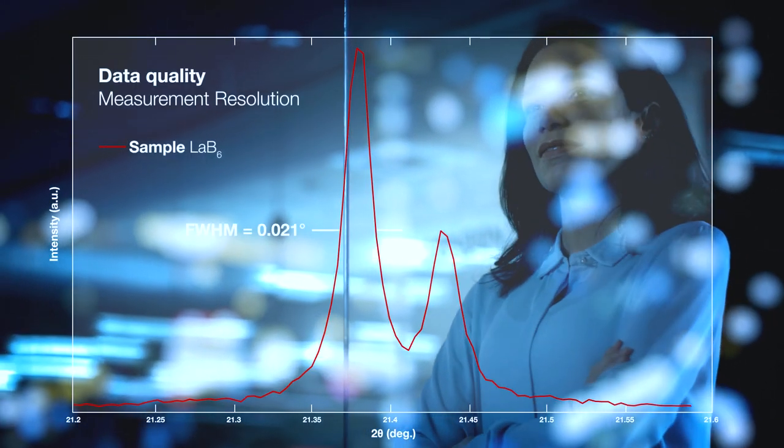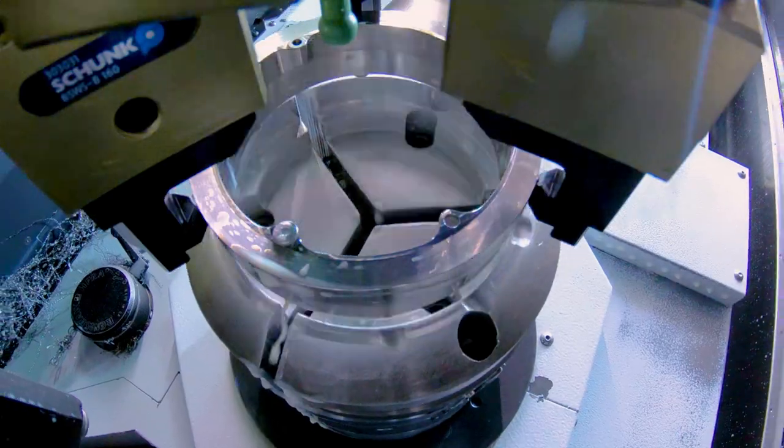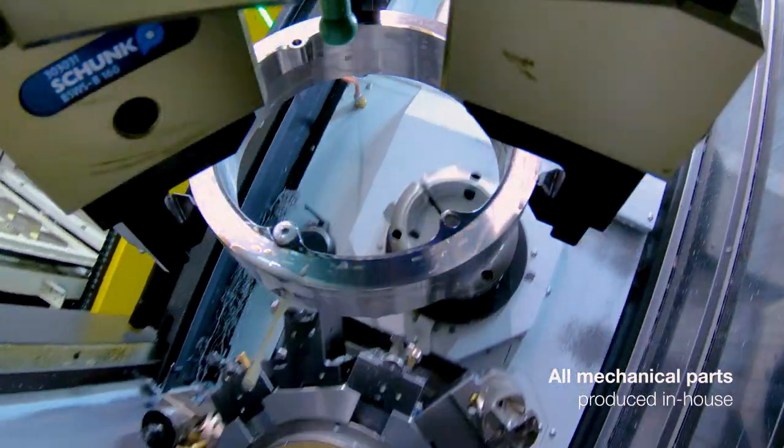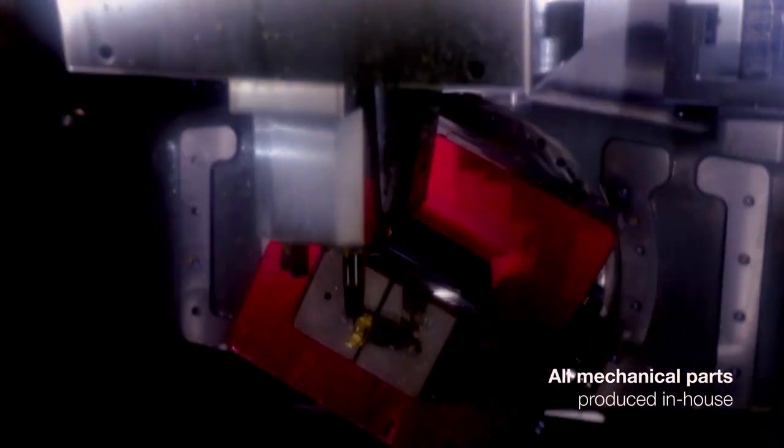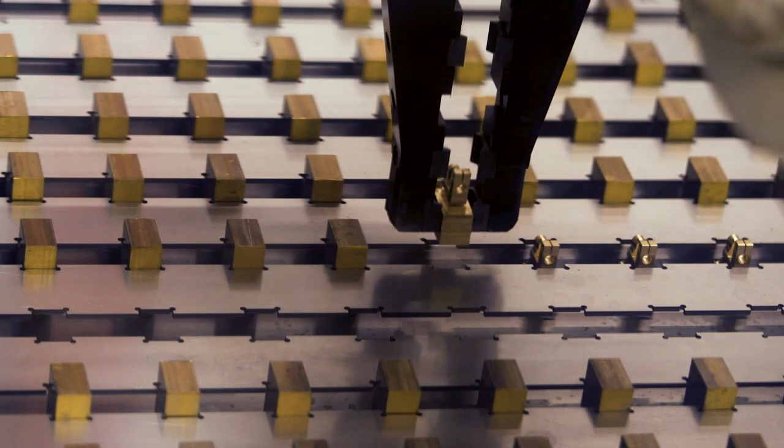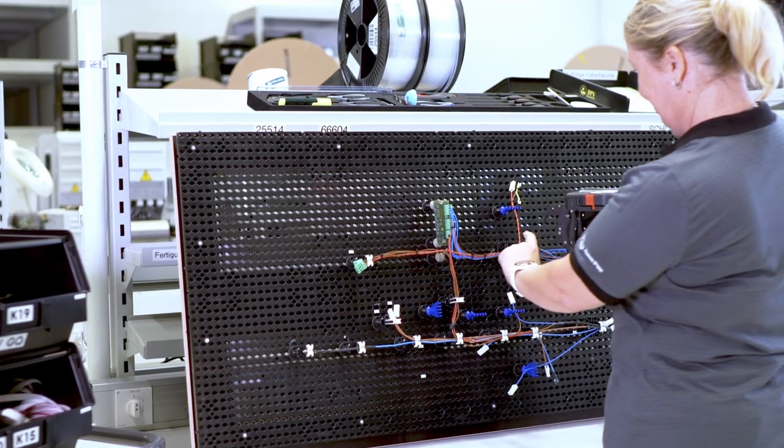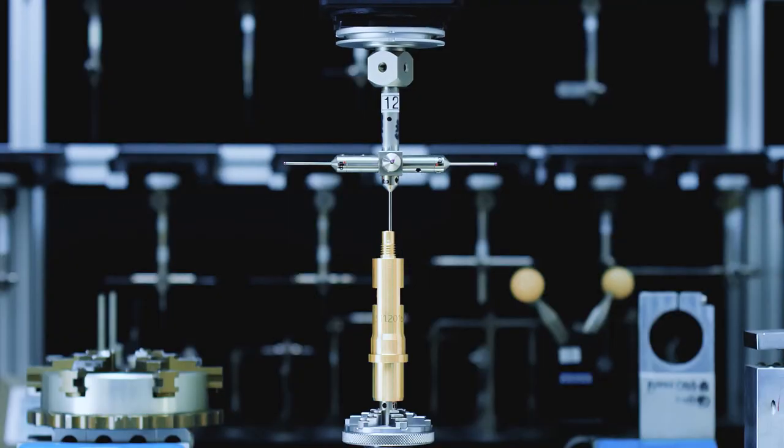Yes, x-ray analytics is in our DNA, and so is manufacturing. All XR Dynamic 500 mechanical parts are made in our high-tech production facilities in Austria. We're obsessed with quality. Every inch of the housing, every screw and cable is built in-house, because we know 100% quality requires 100% control.